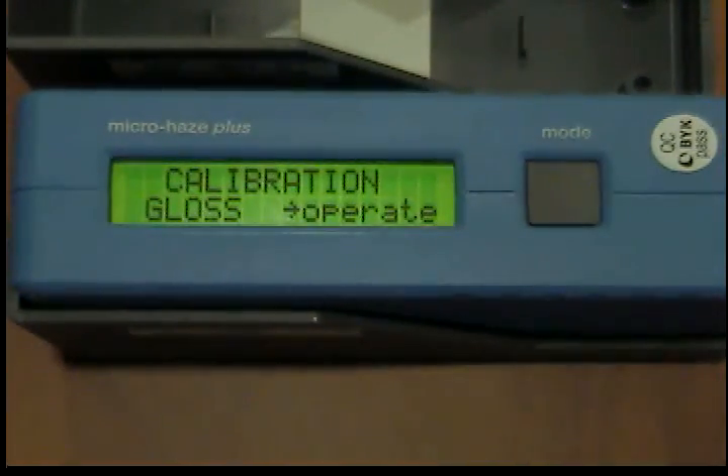Now switch on the unit using the mode button. Calibration gloss appears in the display. The arrow indicates that the calibration procedure will be performed by pressing the operate button.